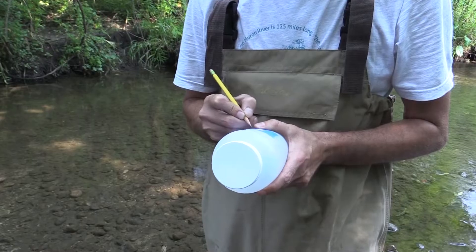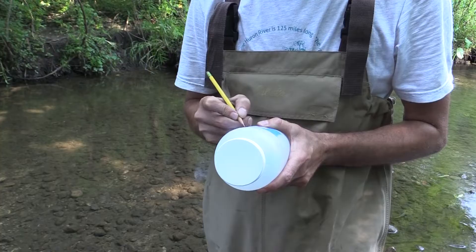Before you begin collecting the sample, make sure to write the date and time on the sample bottles.